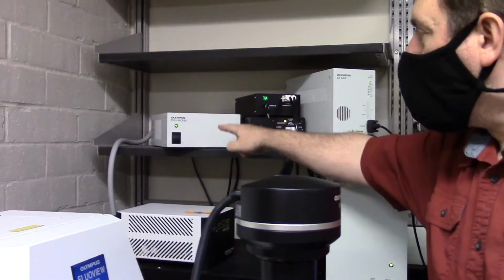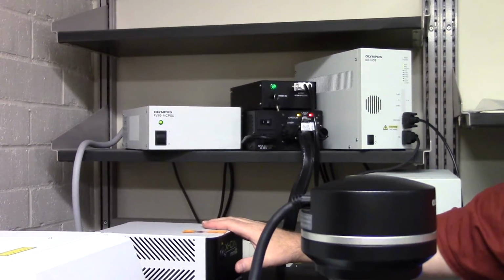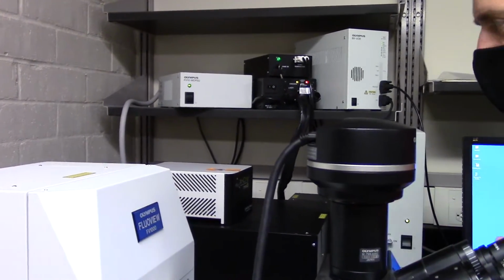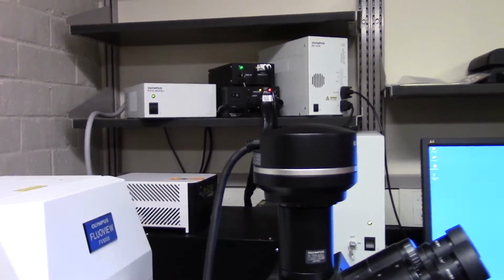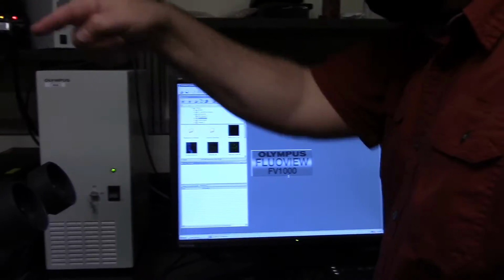So now I have all three lasers and the fan turned on, so that we now have a new light supply. We no longer need the epifluorescence because we're already in focus on the microscope stage slide of what we want to see. So now that this is connected, let's open up the program again. And this time we'll ask it, please talk to the microscope.